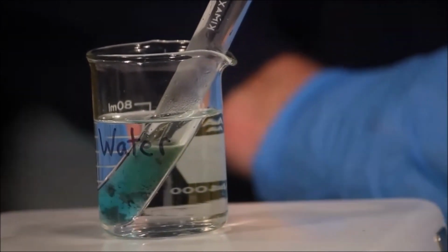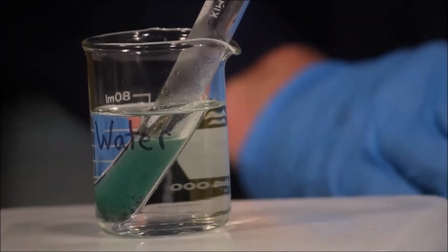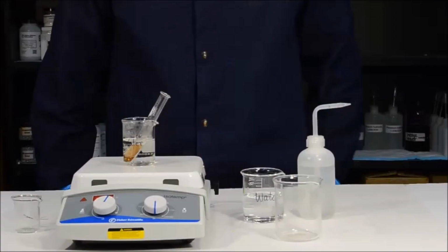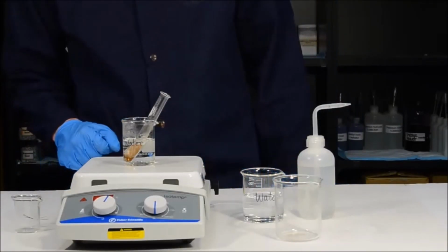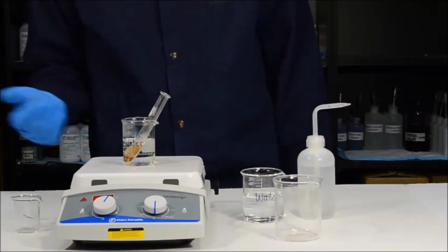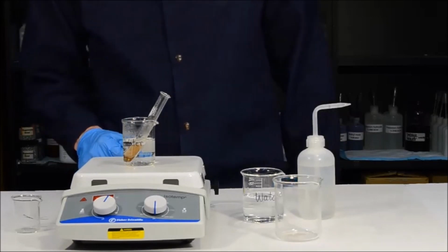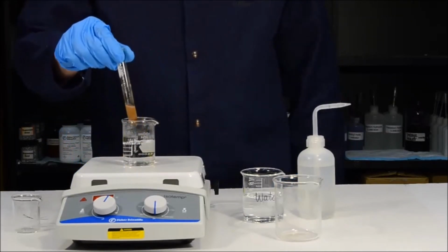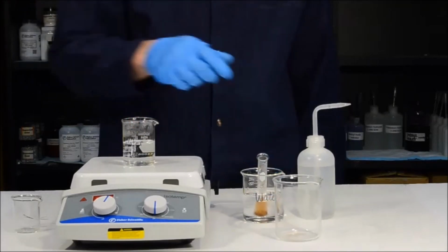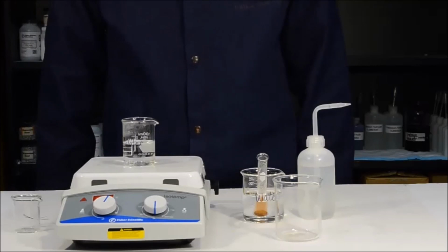Just as soon as this reaction starts, you can actually see the formation of copper metal as it is reacting with the magnesium. It's now been about 15 minutes, and as you can see, the reaction mixture has changed drastically. Instead of the blue copper(II) sulfate, we now have copper metal precipitated in the bottom of our test tube. Now what we want to do is simply take this out of the boiling water and place it into a cool water bath to cool the solution down before we continue to the next step.